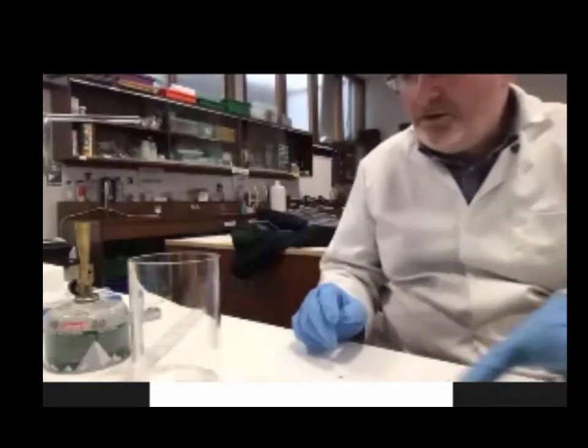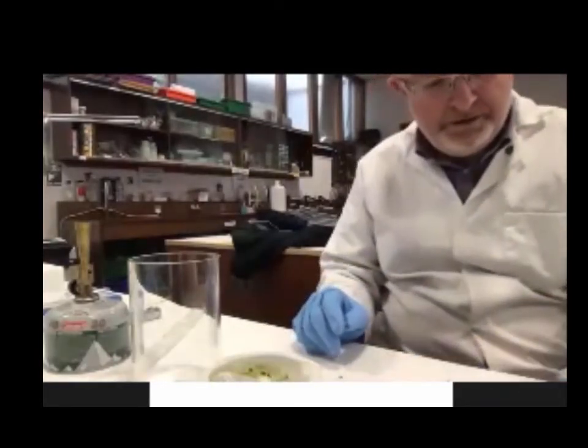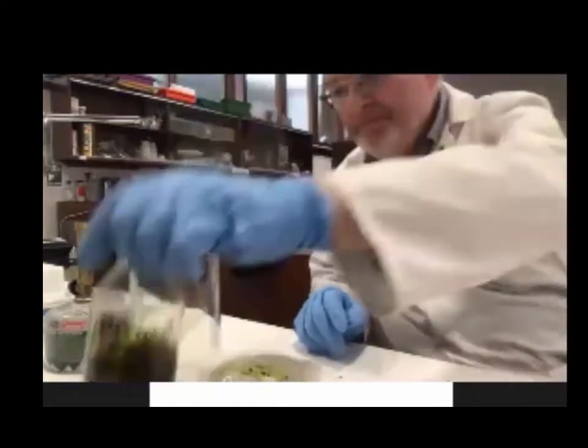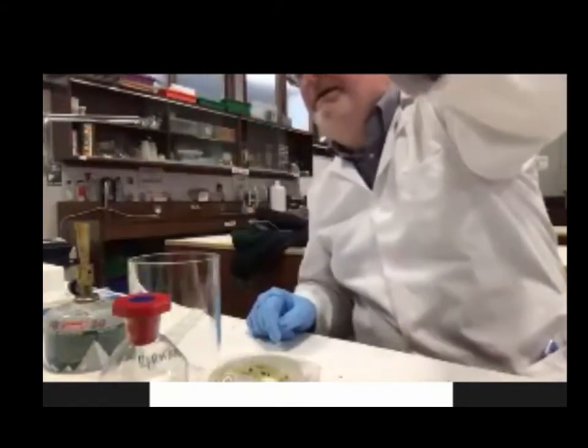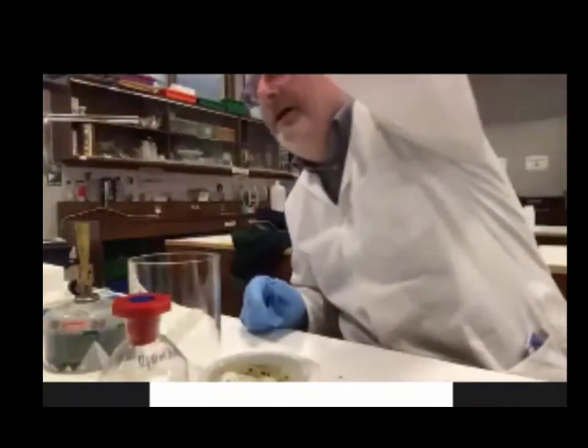One of the mandatory experiments then, so that's taking chlorophyll out, which is kind of an important biochemical. All right, but it's taking out lots of other things, and we're trying to separate those out. If I just take out the chromatography plate, you can see immediately, as he dribbles solvent over his computer, you can see there the line already starting of the pigment coming out.